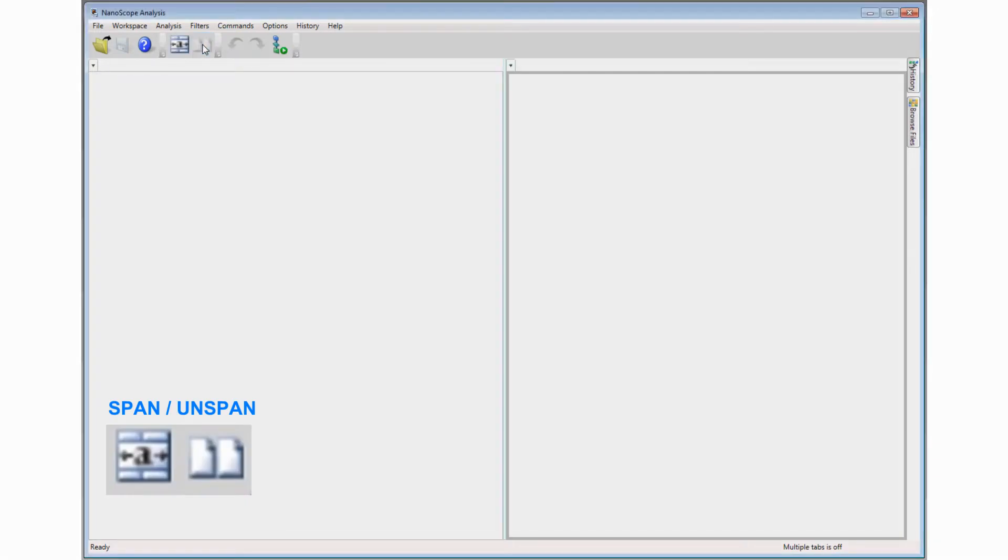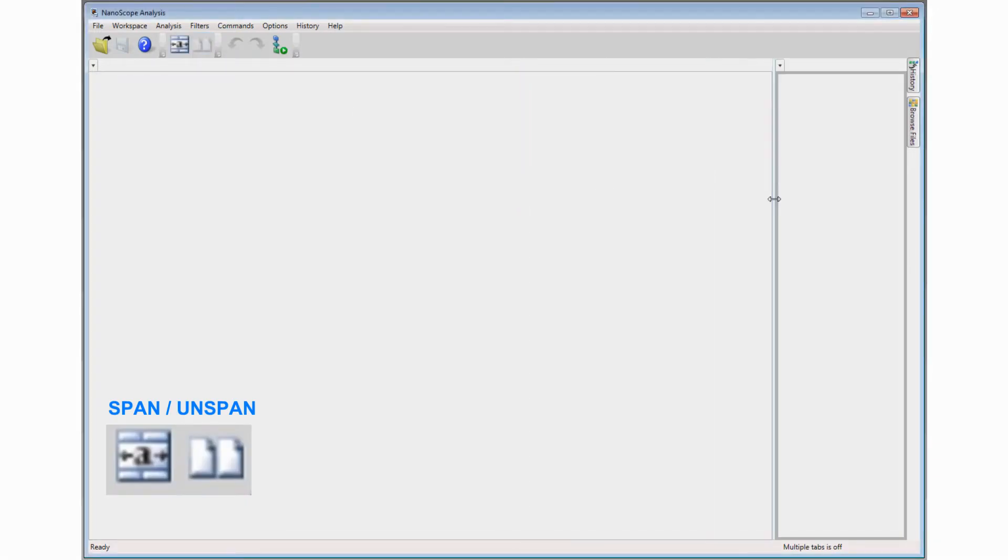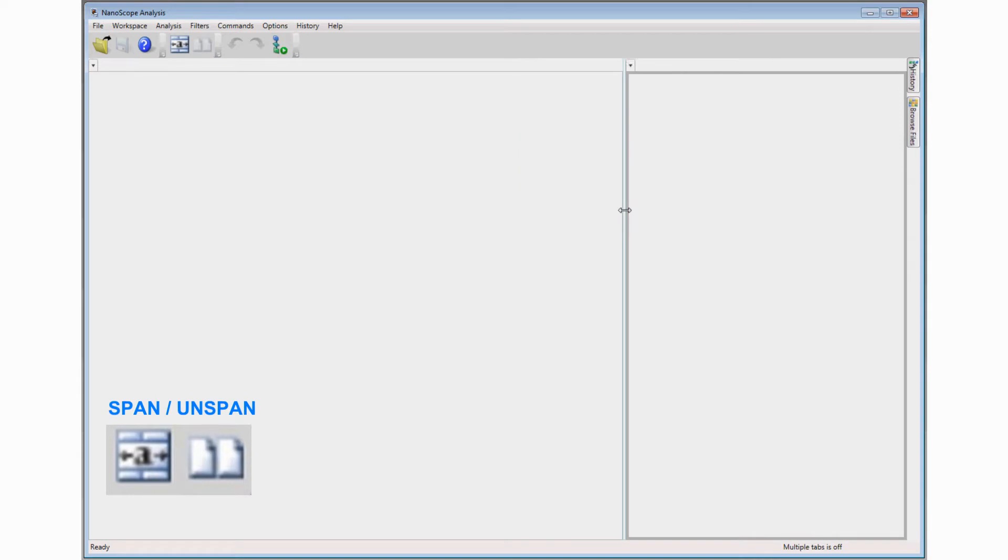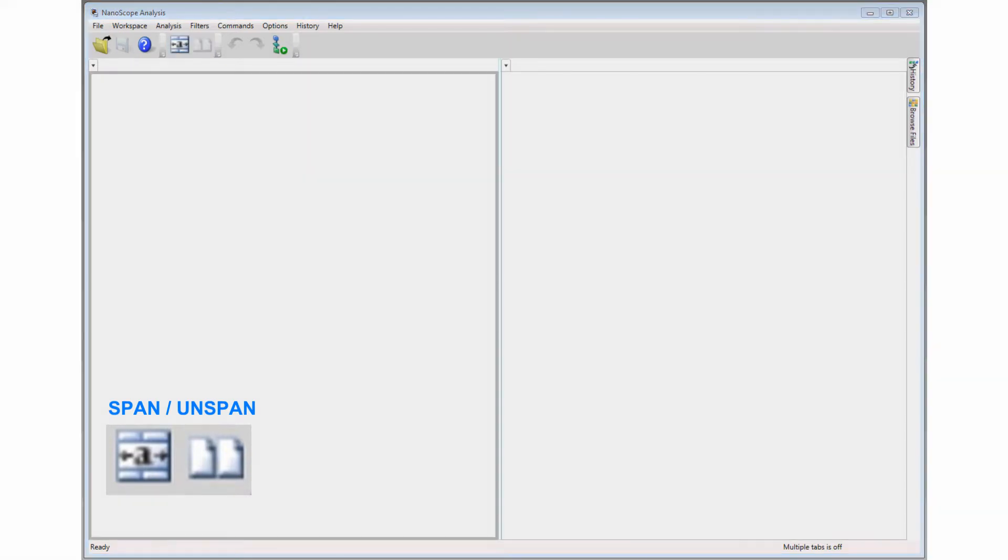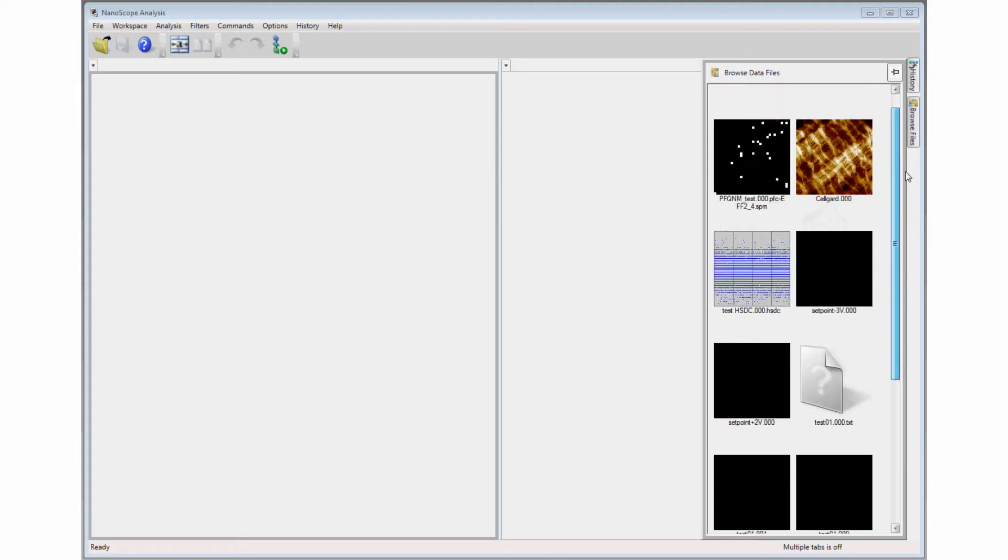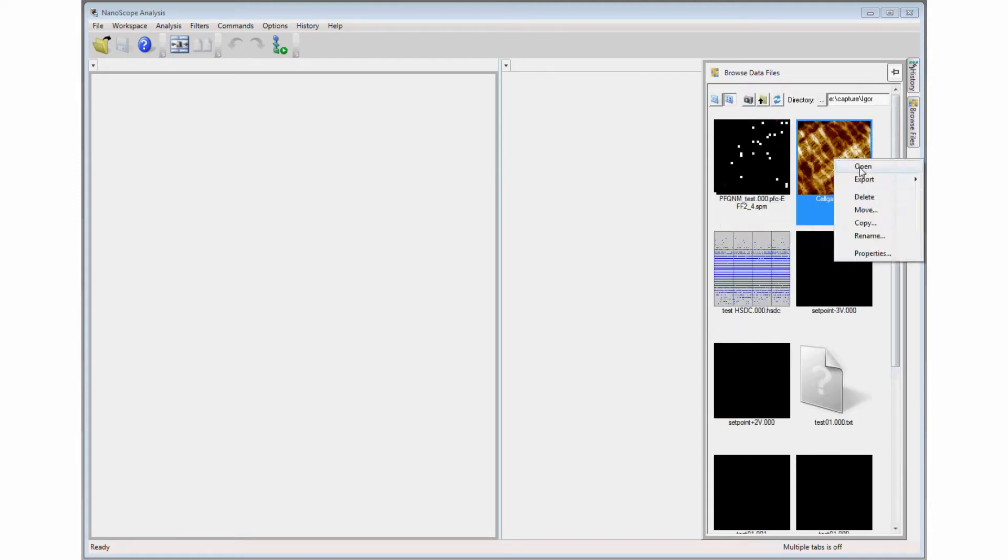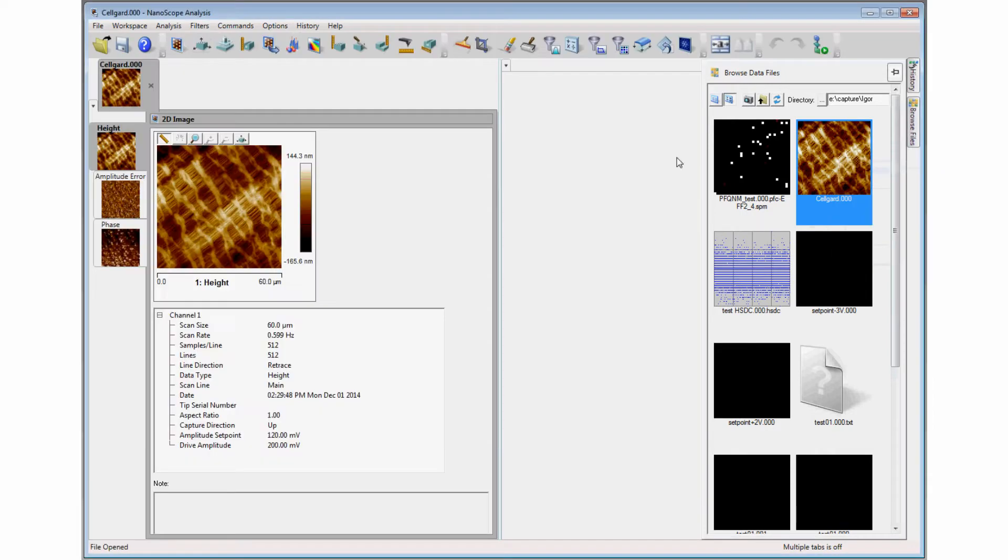When the interface opens, the user can define the workspace area for one image or two using the span and unspan commands. The Browse Files tab expands to provide a thumbnail view of each file from a selected folder and allows the user to select and open that file.